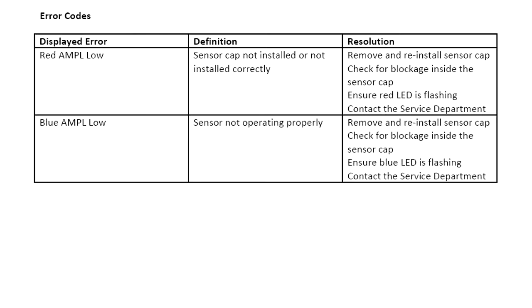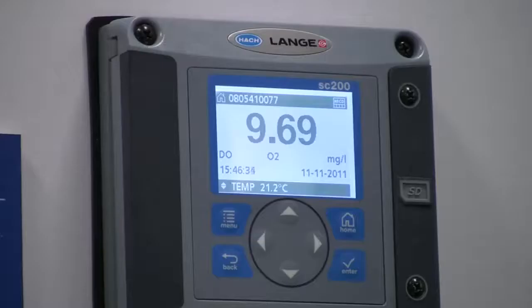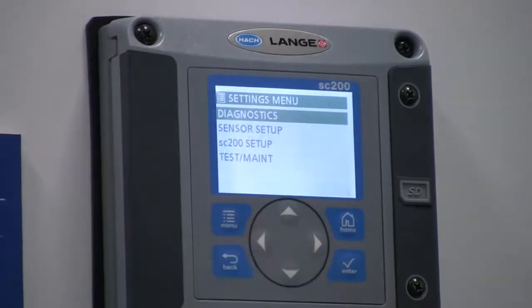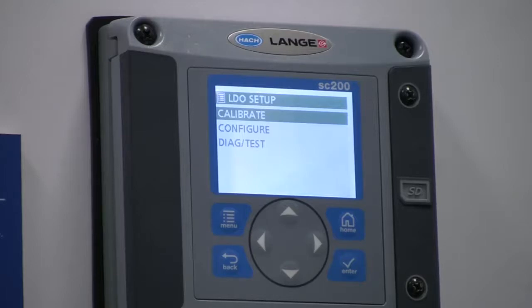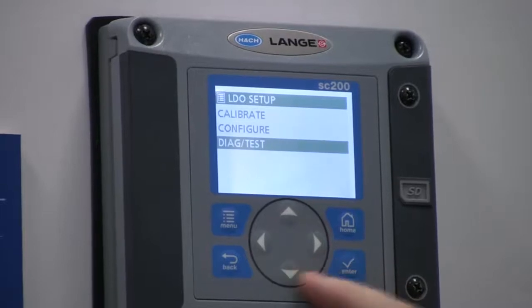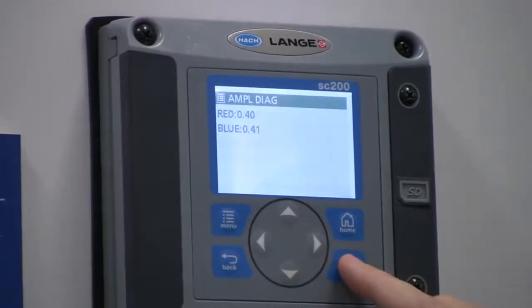You need to clear the cause of the error and confirm the displayed error on the screen of the controller. Start from the main menu and highlight Sensor Setup and confirm. Highlight the correct sensor and confirm. Then highlight Amplitude Diagnostics and confirm again. The LEDs transmit light onto the inner surface of the sensor cap and the light is reflected back down to the detector inside the sensor. The amplitude increases as more light is reflected. Typical values are from 0.1 to 0.5. The alarm warning occurs at 0.01 to 0.03.